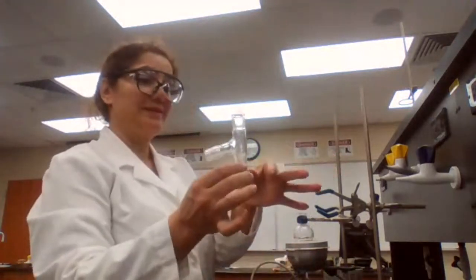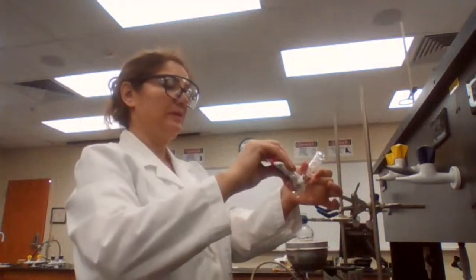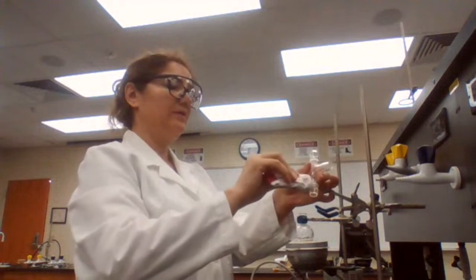Then is the distillation head. Anytime you have a glass joint, you must grease the glass joint and make sure that they are clamped.